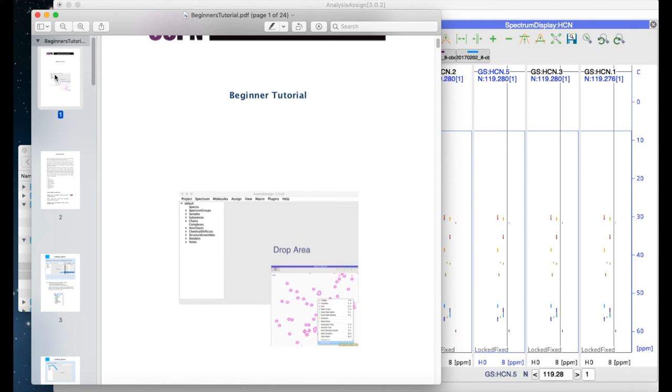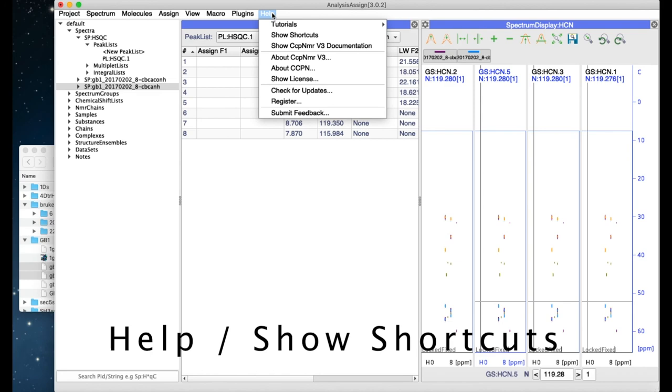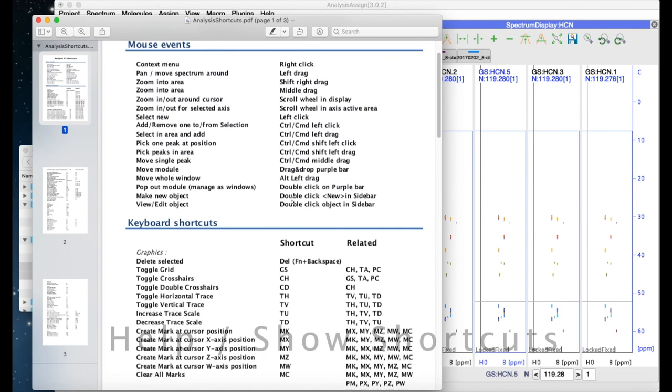The Help menu also includes a list of all the keyboard and mouse shortcuts for you to check through.